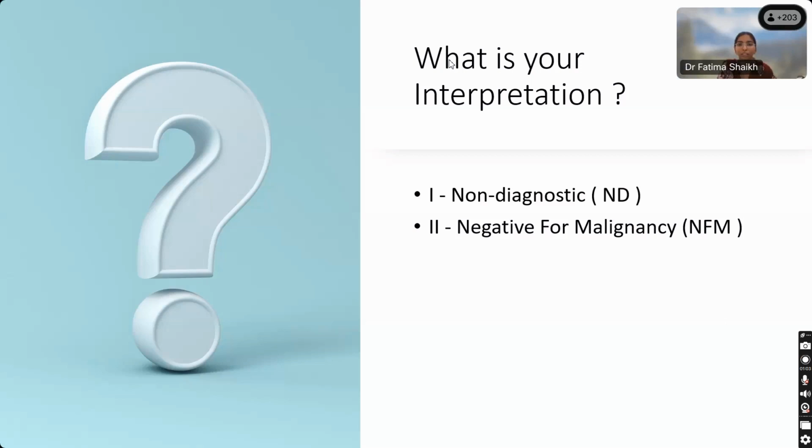What is the optimum time from the time the fluid is removed to the time it is received and processed in the laboratory, to give you a good cell morphology? 4 to 6 hours? No, that's quite a big gap. We ideally say half an hour, but a maximum of 1 hour is okay for the cells. Otherwise, if you are expecting delay, you have to keep it in the refrigerator, and then you can preserve the specimen and the cells for 4 hours, 6 hours, 8 hours, even 24 hours and 48 hours.